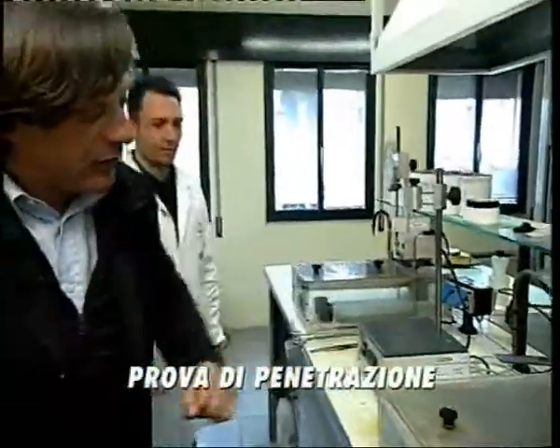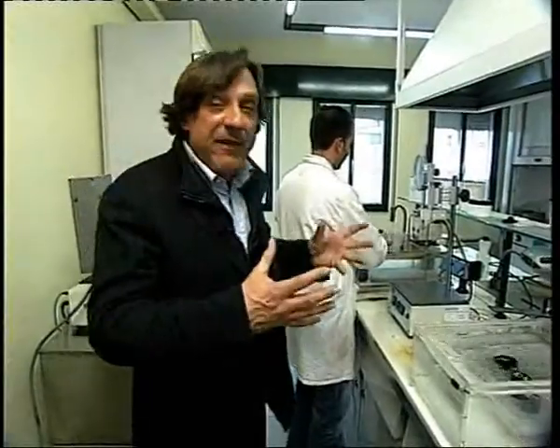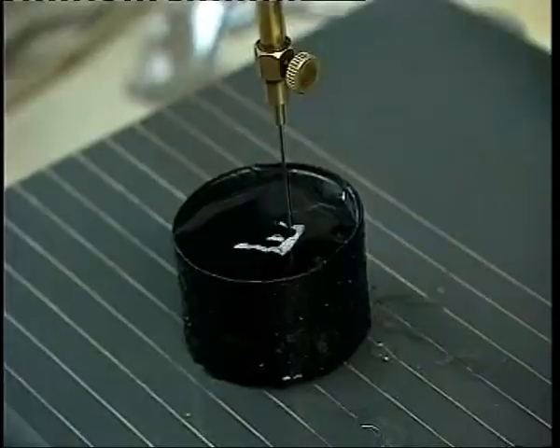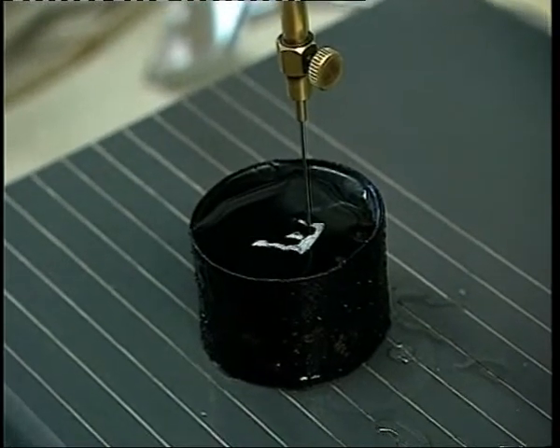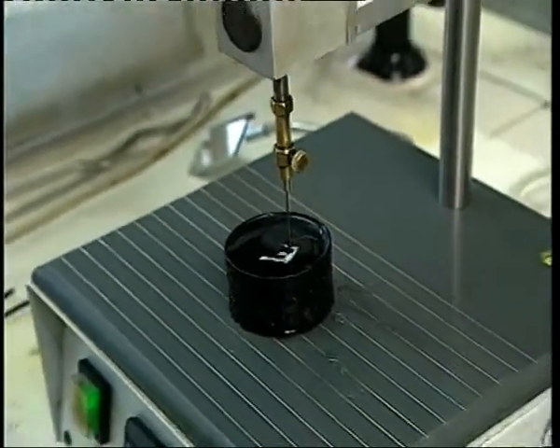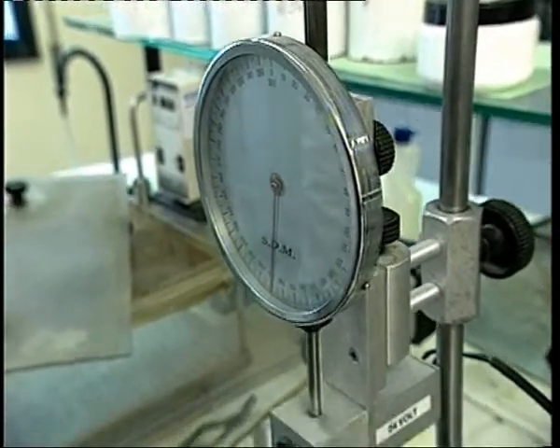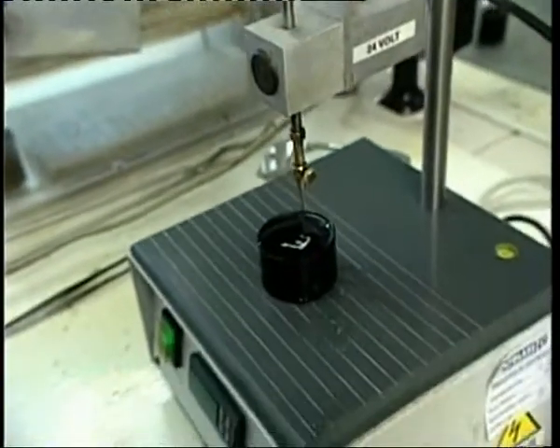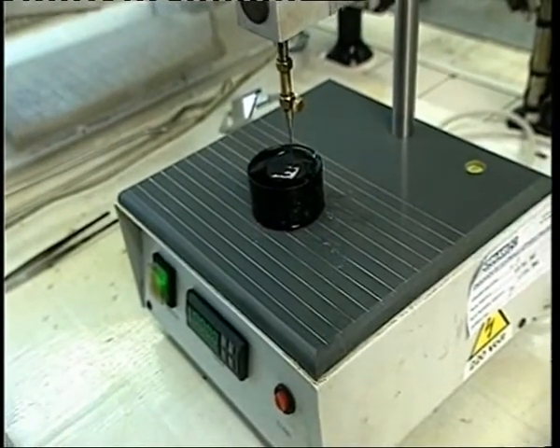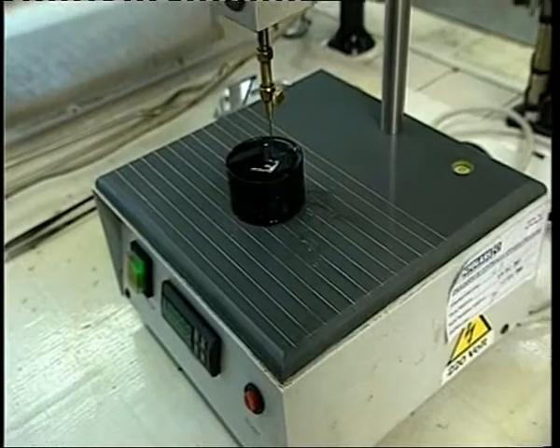Now we'll talk about the penetration test. The penetration test, which our colleague will help us see, is an important part in the product evaluation process and is conducted on both the raw material, the bitumen, and the compound, or in other words, the bitumen already enriched with resins. The test consists in pushing this needle into the bituminous mass. The softer our bitumen compound is, the greater the penetration will be. Test results are expressed in tenths of millimeter, and this important parameter helps us understand how workable the compound will be on site, how malleable it will be, and how easy it will be to melt.